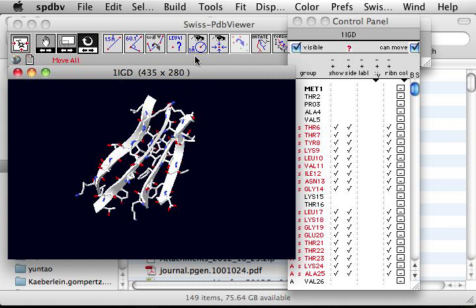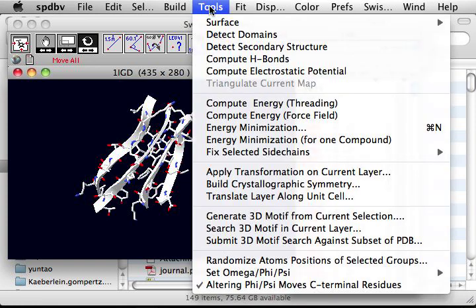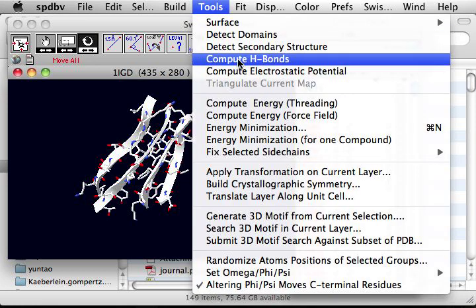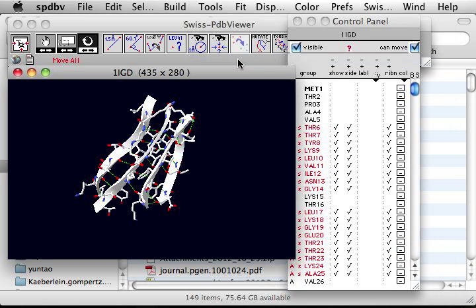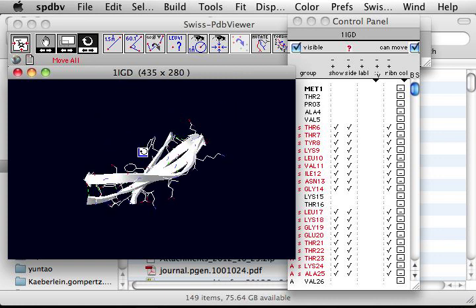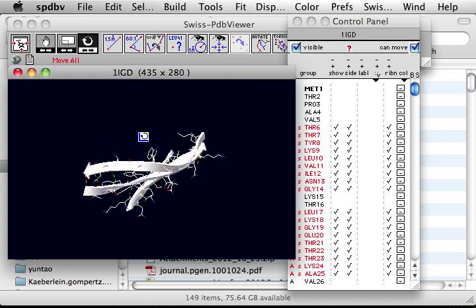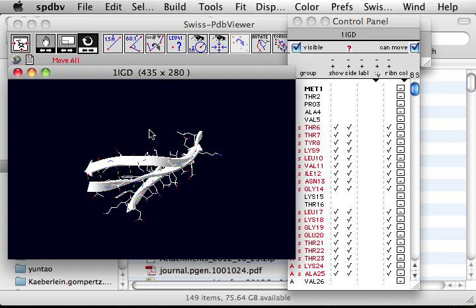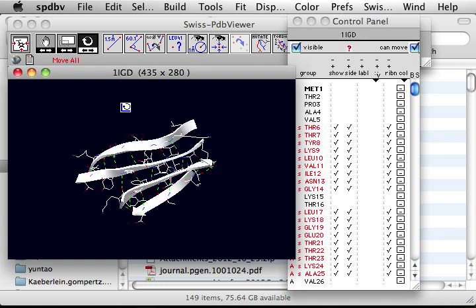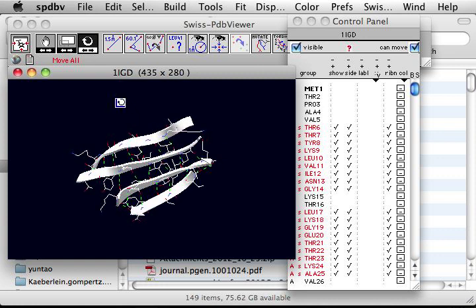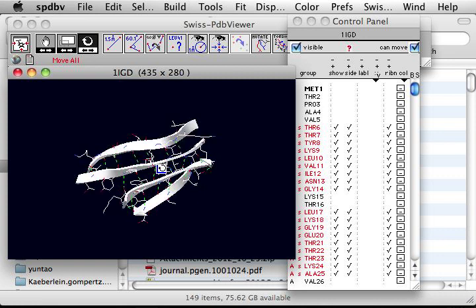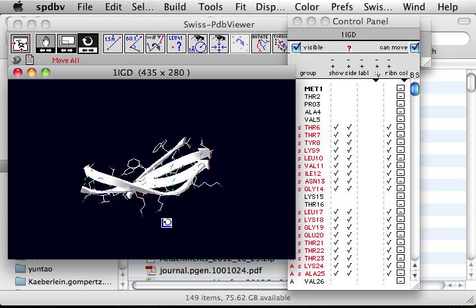And then I go to tools to compute hydrogen bonds. So now we can see the hydrogen bonds between the beta sheets. So beta sheets are held together by the between-strand hydrogen bonds.